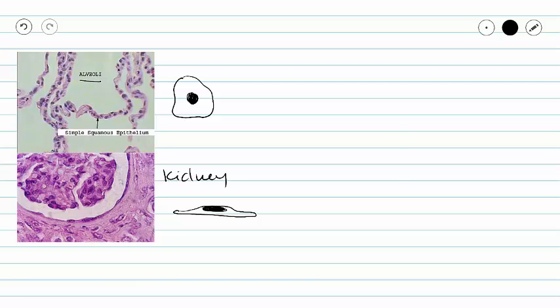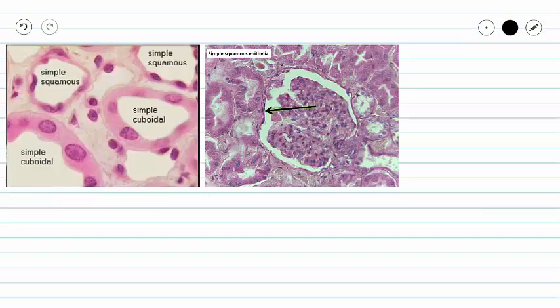One more picture and then we'll be done. Here we see our kidney on the right where simple squamous epithelium is pointed out with an arrow, but we can also see some simple cuboidal epithelium here. When you're looking at a kidney slide, don't be alarmed that you see multiple types of tissues. The simple cuboidal epithelium will be covered in a different video. If you have any questions, please do not hesitate to contact your instructor.